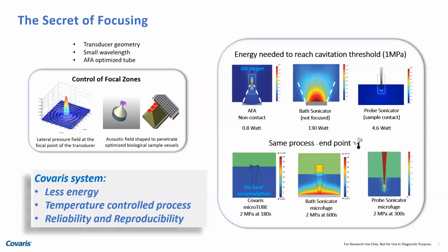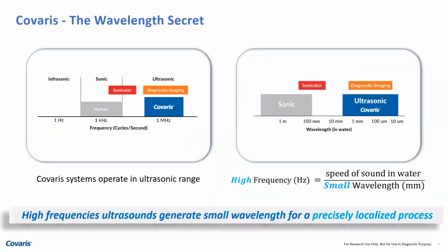So it is maintained at a certain temperature, so it's temperature controlled. You can keep it at the temperature that you desire. We typically work with 7 degrees, 10 degrees Celsius, so it works in that temperature domain. So no heat imparted to the sample and no contact with the sample. So over the years, this has been, I mean, this is the energy difference I was referring to.